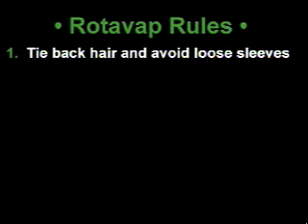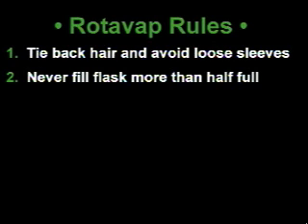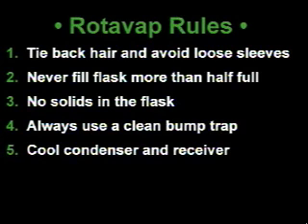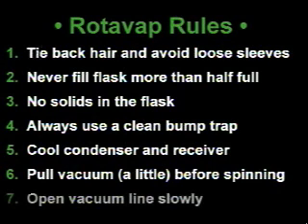Let's quickly recap the Rotavap rules that we have learned. Rule number 1, tie back your hair and avoid loose sleeves. Rule number 2, never fill your flask more than half full. Rule number 3, no solids should be in your flask. Rule number 4, always use a clean bump trap. Rule number 5, cool the condenser and the receiver before you attach your flask. Rule number 6, pull vacuum just a little bit before turning on the rotary motor to spin your flask. And rule number 7, open the vacuum line slowly so that you don't cause your material to bump.